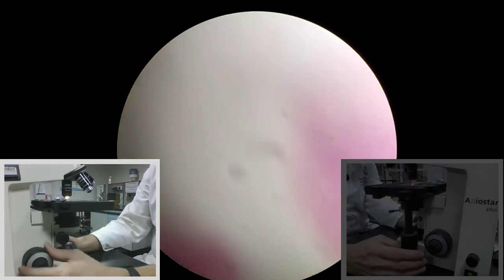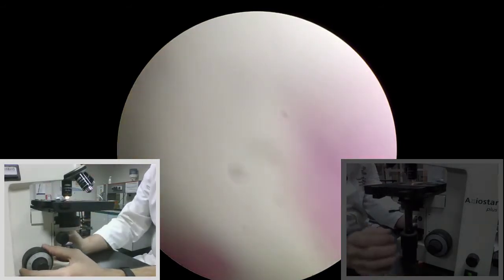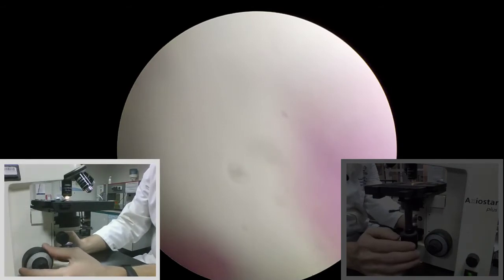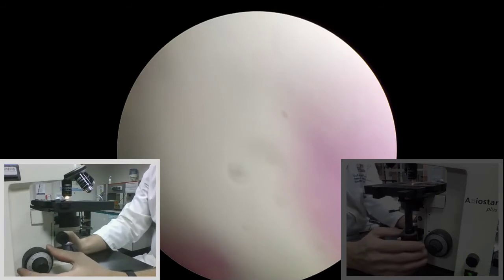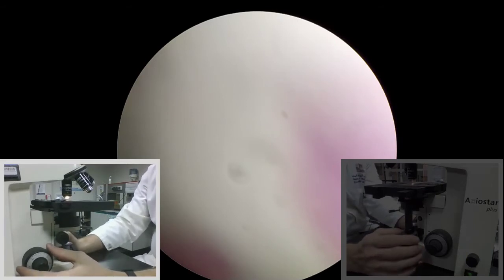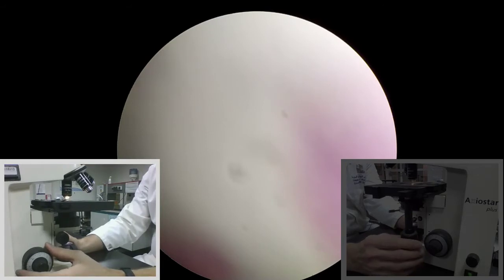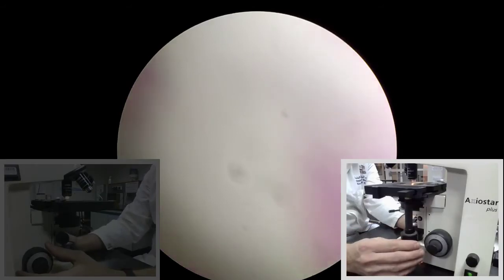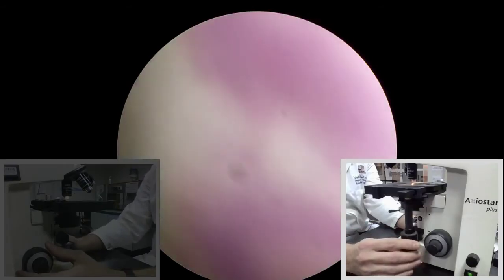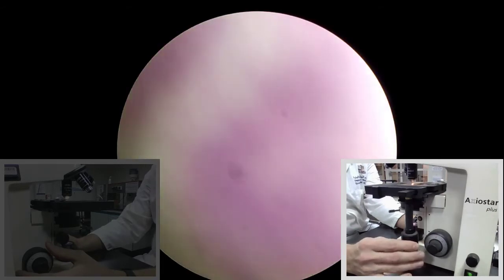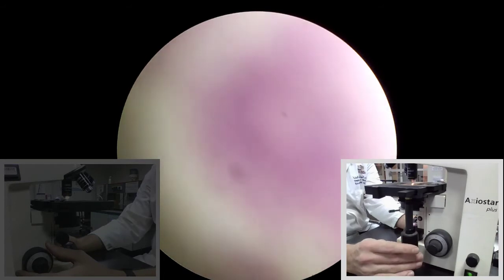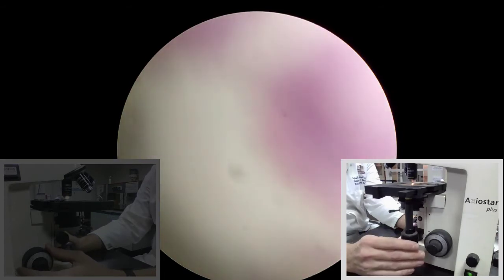This is a fairly low power lens, so I bring it all the way up as far as it will go — it won't touch the lens, so it's a pretty safe place to start. As you can see in my field of view right now, I don't really see much that's in focus; it's a little bit of a blurry sort of pink something. I can use my stage controls to help me move back and forth, and I can see that what's currently out of focus is in fact on this slide.